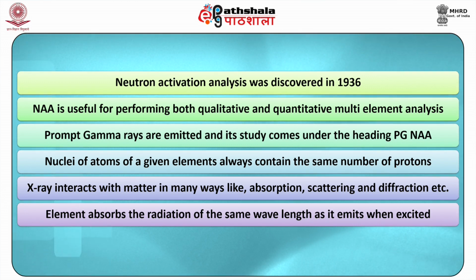X-rays interact with matter in many ways, like absorption, scattering, and diffraction. Atomic absorption spectrometry works on a simple principle, that is, an element absorbs radiation of the same wavelength as it emits when excited.